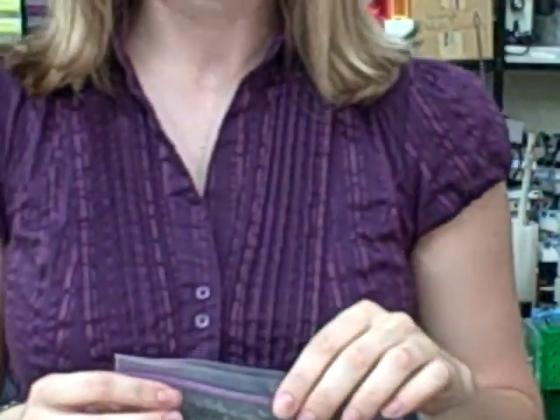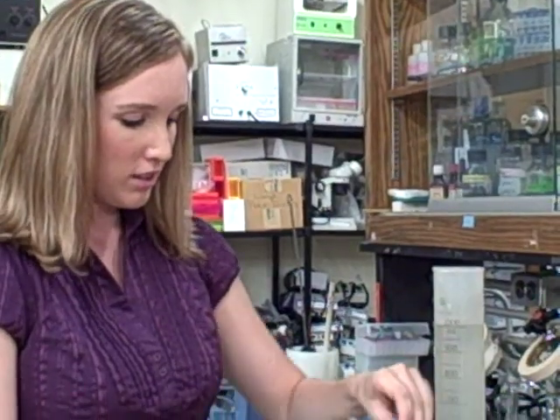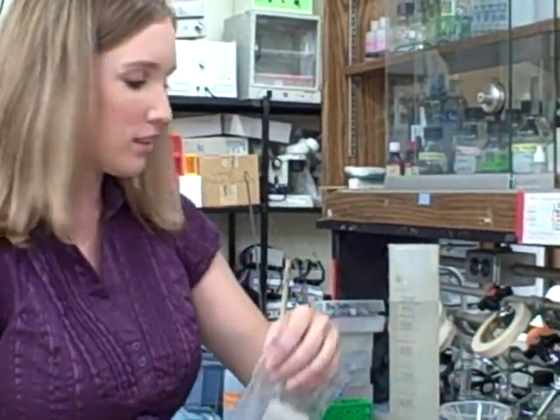I'm going to be making a TBE buffer solution for use in gel electrophoresis today. All the contents that you need are contained in this bag except for the water. So I'm going to open up the bag and pour it into a 1 liter container.